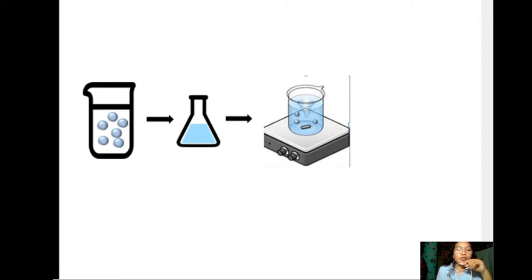The concentration of methylene blue in solution will be recorded at 30, 60, 90, and 120 minutes, since this phenomenon usually takes a relatively longer time: the methylene blue molecules will reach the boundary layer, diffuse into the adsorbent surface, and finally diffuse into the porous structure of the adsorbent.